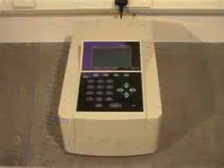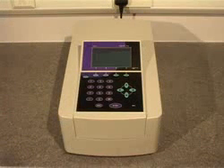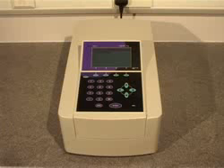The Expert Plus. Excellent performance and reliability from Biochrom.